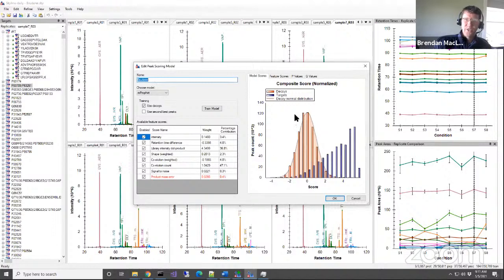And so here the scores for the decoys are these orange scores, and for the targets are these blue scores. What we're looking for is we're expecting that under the decoys will be the false discoveries. So there is some sort of distribution here that's similar to this. It's just that the vast majority of things are separated and we believe are actually true hits.